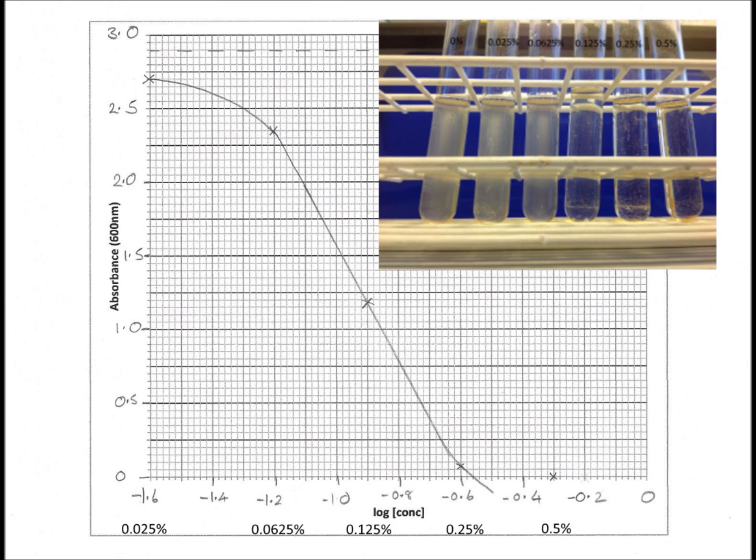You can see that we have high absorbance readings for tubes 2 and 3, moderate one for tube 4, and that there was some growth in tube 5 where we had 0.25% Chloros because we have a positive absorbance reading there. However by the time you get to 0.5% Chloros in tube 6 there's no growth and the absorbance reading is 0.